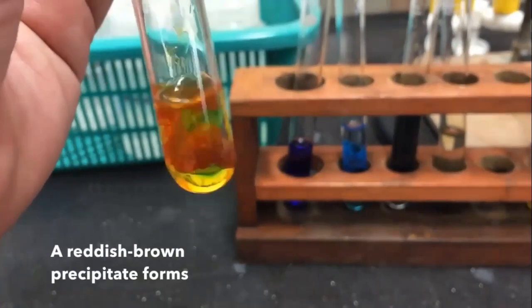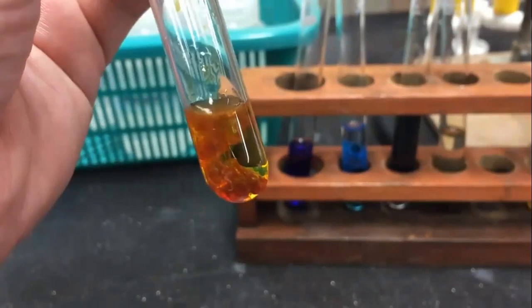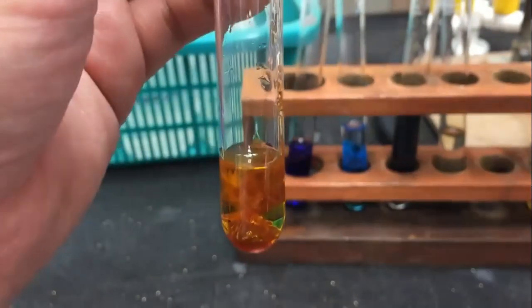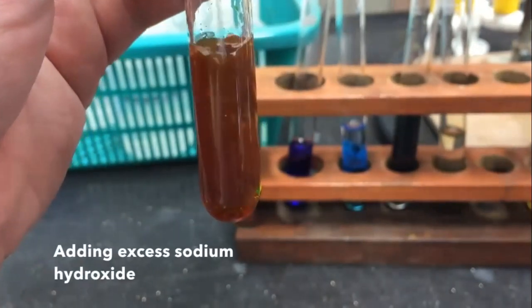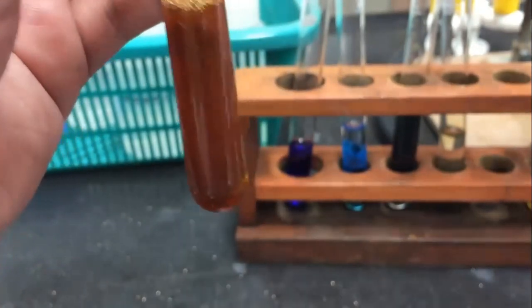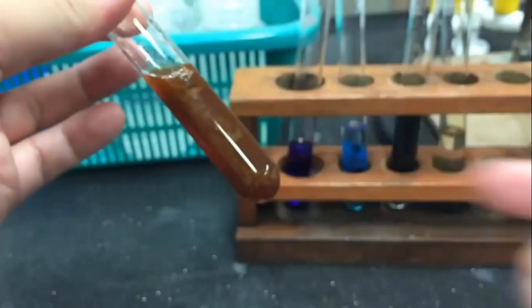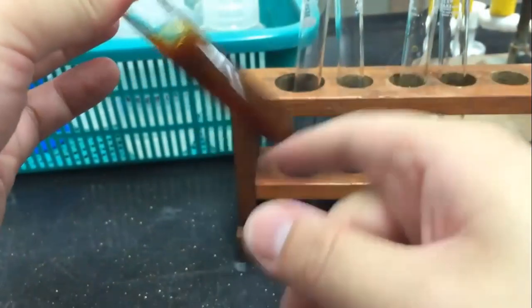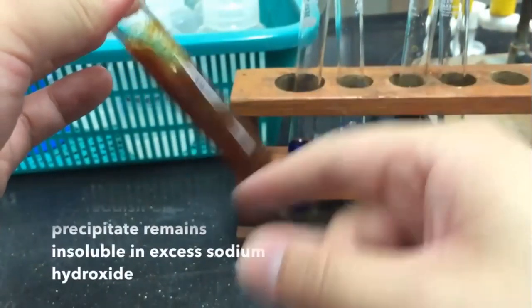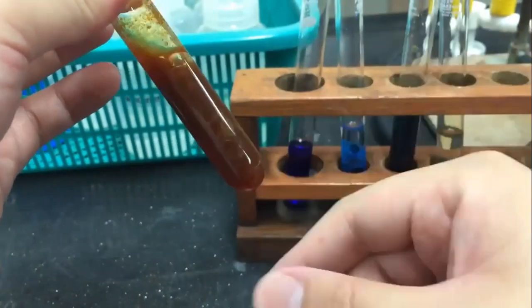You will notice that a reddish-brown precipitate forms. Proceed to add excess sodium hydroxide solution. Notice that the reddish-brown precipitate remains insoluble in excess sodium hydroxide.